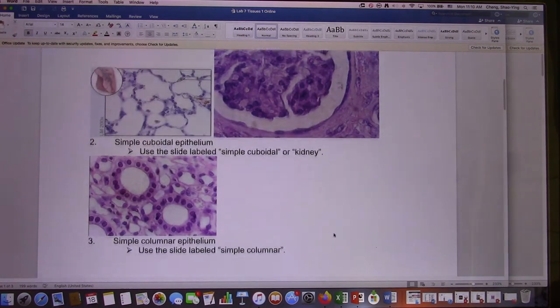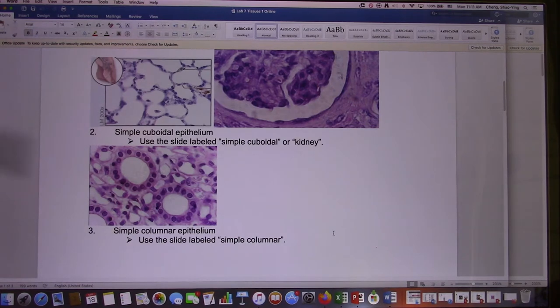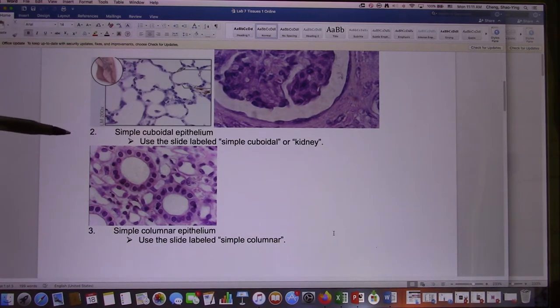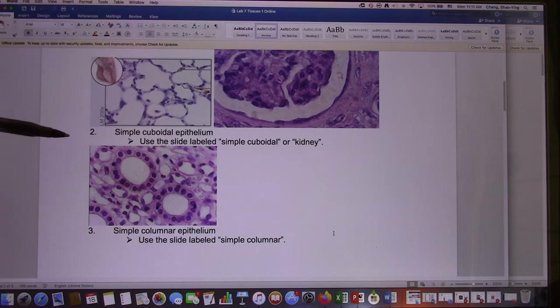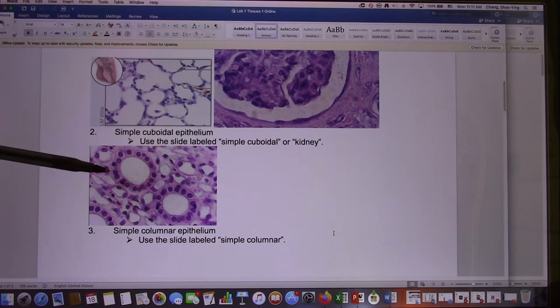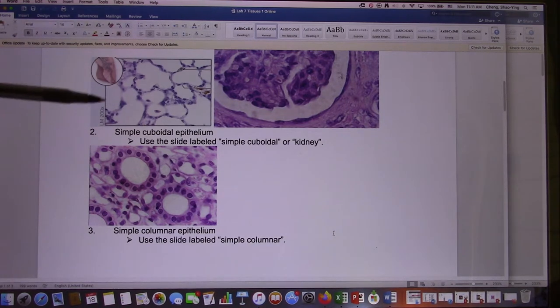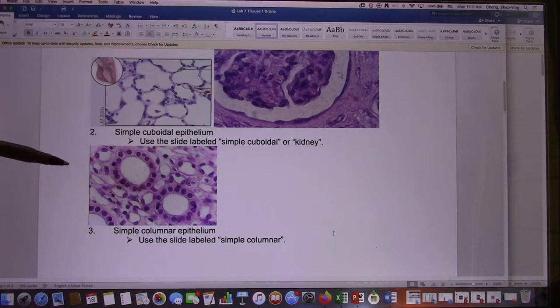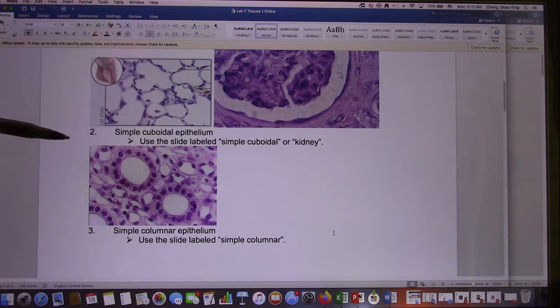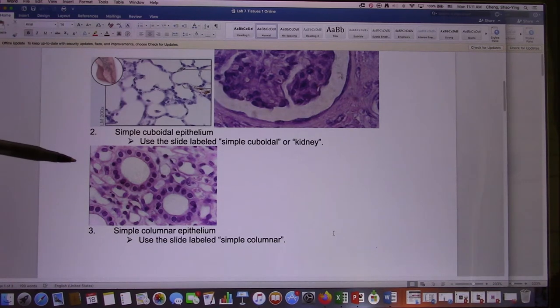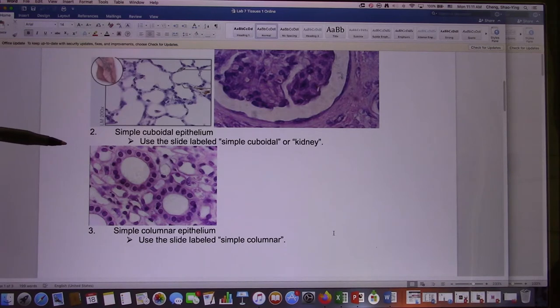Now let's look at the simple cuboidal. All these pictures are still from the textbook. Simple cuboidal — one layer and it's cube-shaped. Every time you look at the slide, you always have more than one kind of tissue because they come from organs, and organs are made of a lot of tissues.